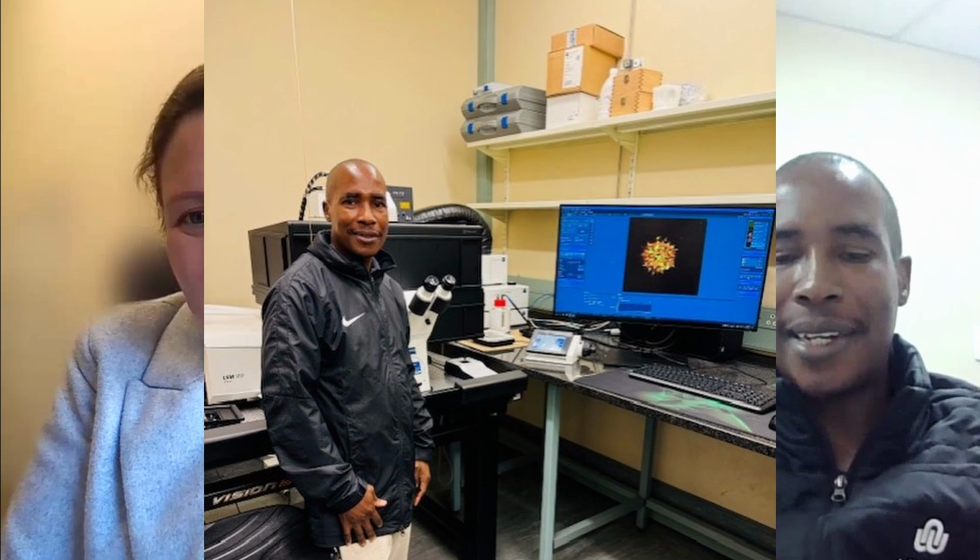Wonderful. So you are now today the operator of the microscope at Northwest University. Tell us about the microscope in the lab, and what do you guys do in the microscopy lab at Northwest University? Yeah, first of all, I would say that the microscope that we have is a Zeiss LSM 980 with Airyscan 2, and it has an incubation system which enables us to do super resolution and also live cell imaging.